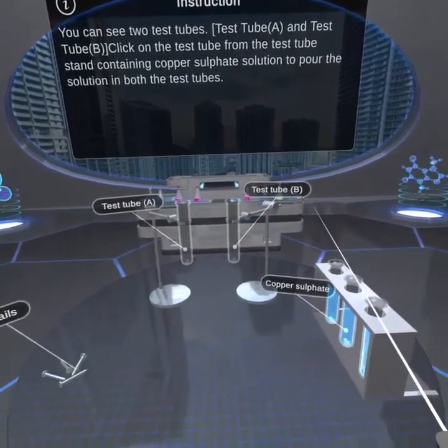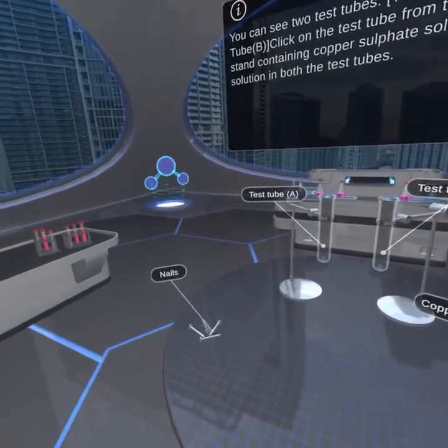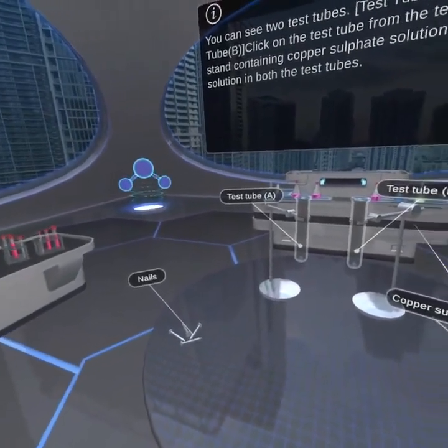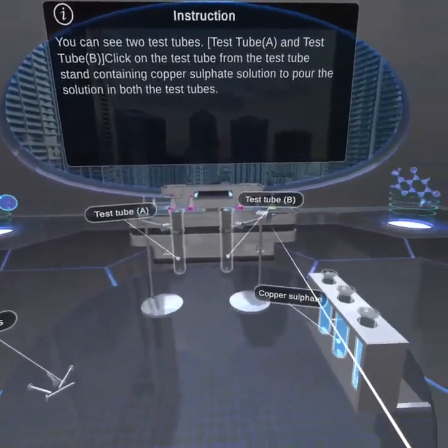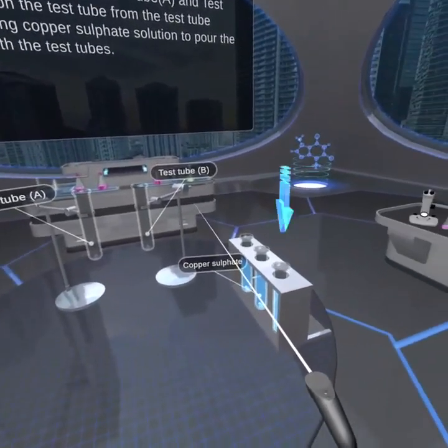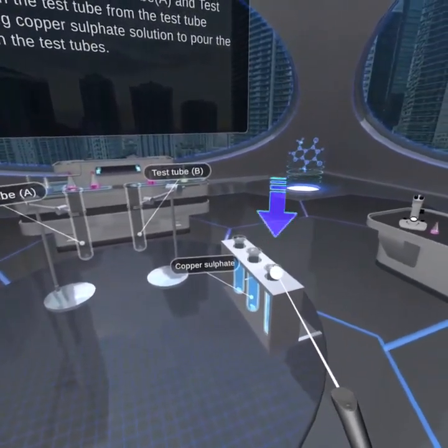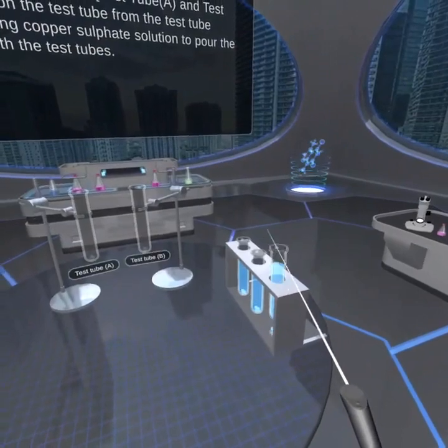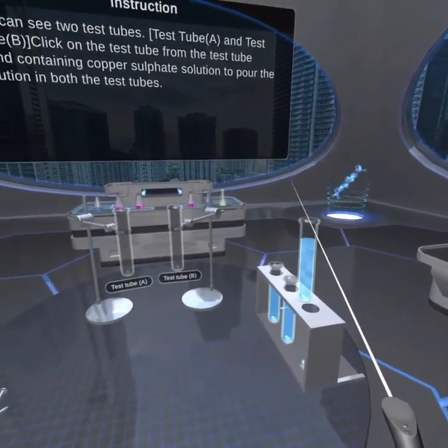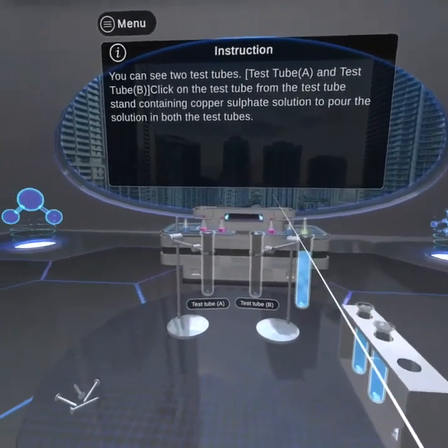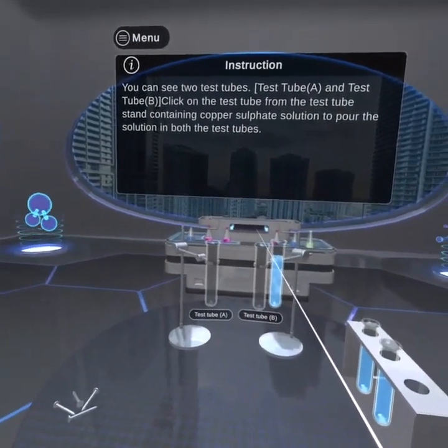You can see two test tubes, test tube A and test tube B. Click on the test tube from the test tube stand containing copper sulfate solution to pour the solution in both the test tubes.